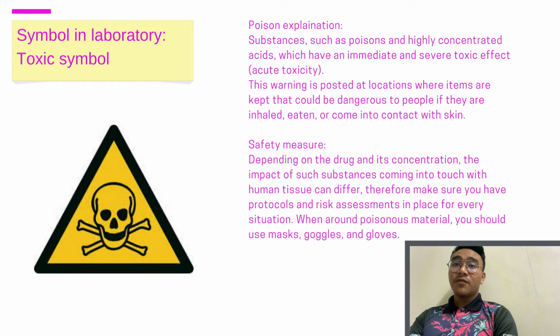For the safety measure, depending on the drug and its concentration, the impact of a substance coming into touch with human tissue can differ. Therefore, make sure you have protocol and risk assessment in place for every situation. When around poisonous material, you should use a mask, goggles, and gloves.